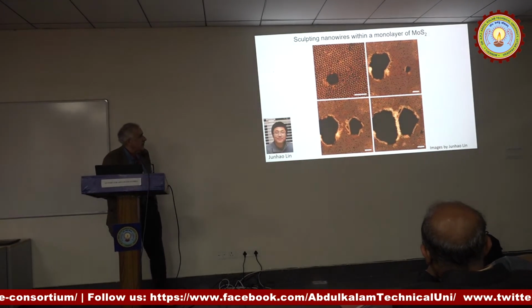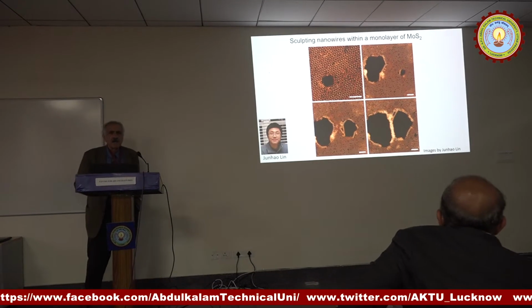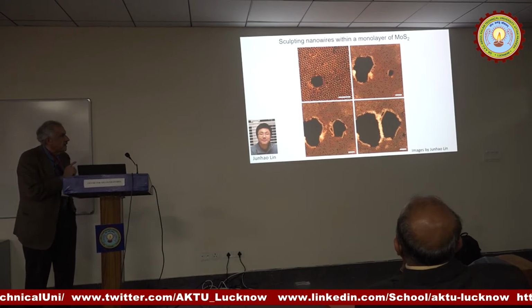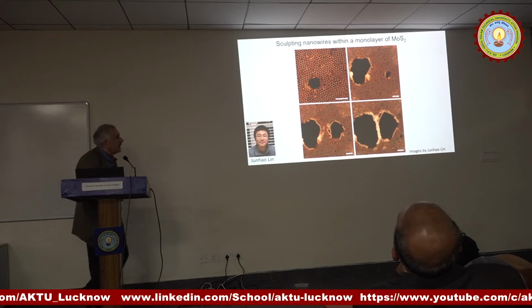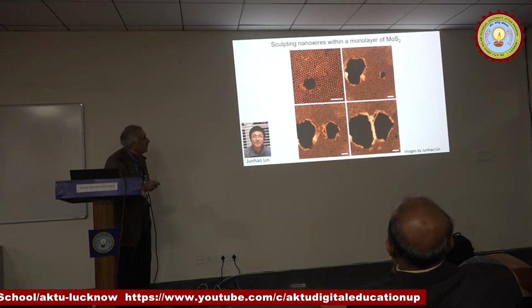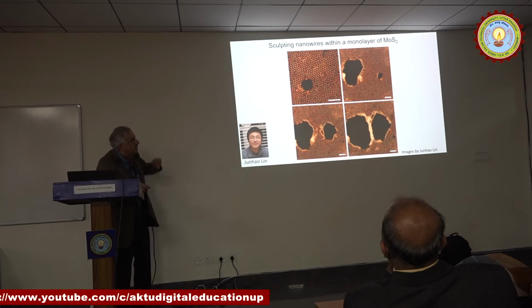This is my student, Junhao Lin. Over the last more than 10 years, I've been training students to do both experiments and theory. And this is one that has done theory and microscopy. And he used the electron beam. This is molybdenum disulfide. You saw some of that in the previous talk. So you see again the individual atoms. These are 3 layers of atoms there.